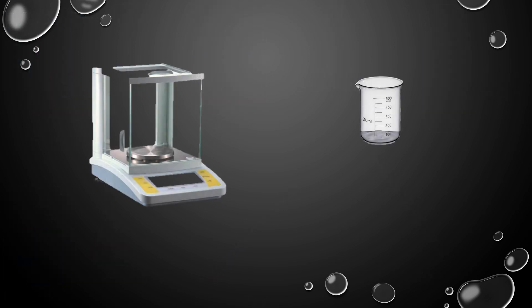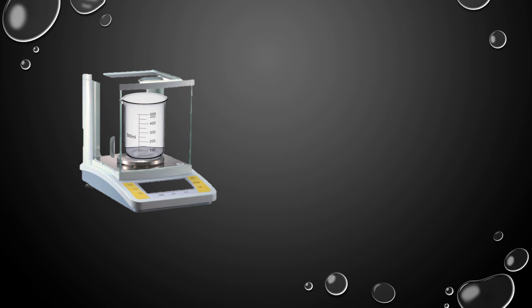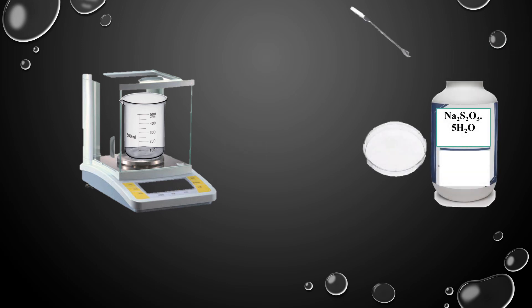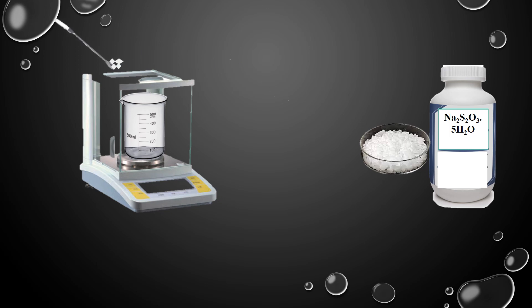Turn the weight balance on. Place the beaker on the weight balance — it displays the beaker's weight. Adjust the weight using the tare button so the weight of the beaker appears as zero. Then take 6.21 grams of sodium thiosulfate in the beaker with the help of a spatula.